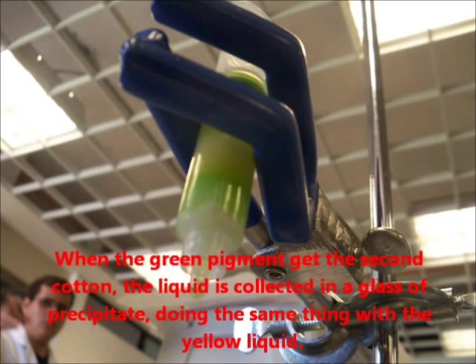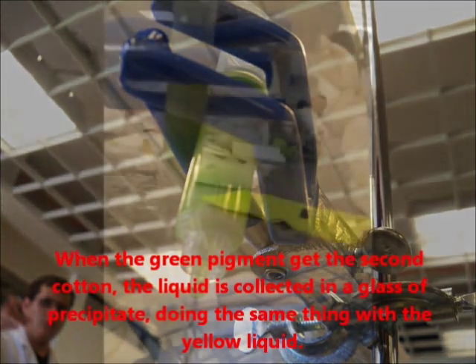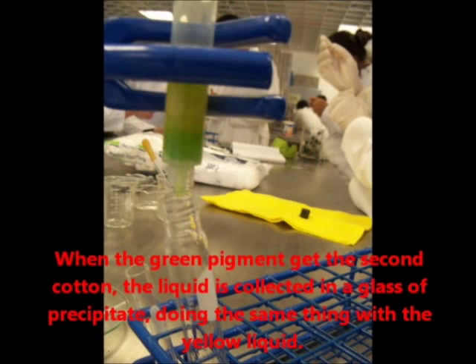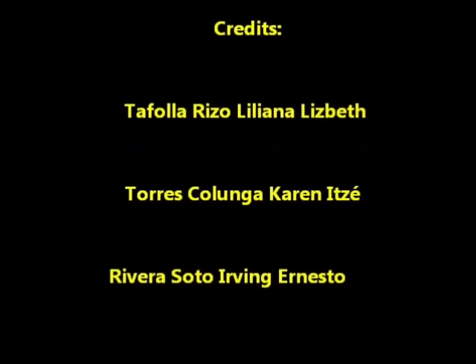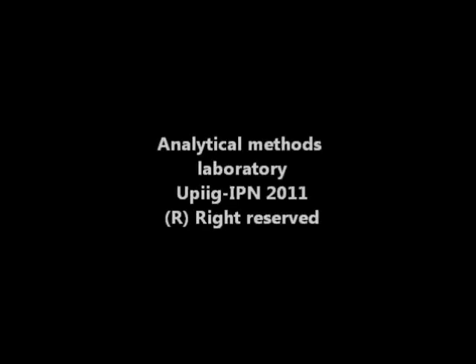When the green pigment reaches the second cotton, the liquid is collected in a glass beaker. Do the same thing with the yellow liquid.